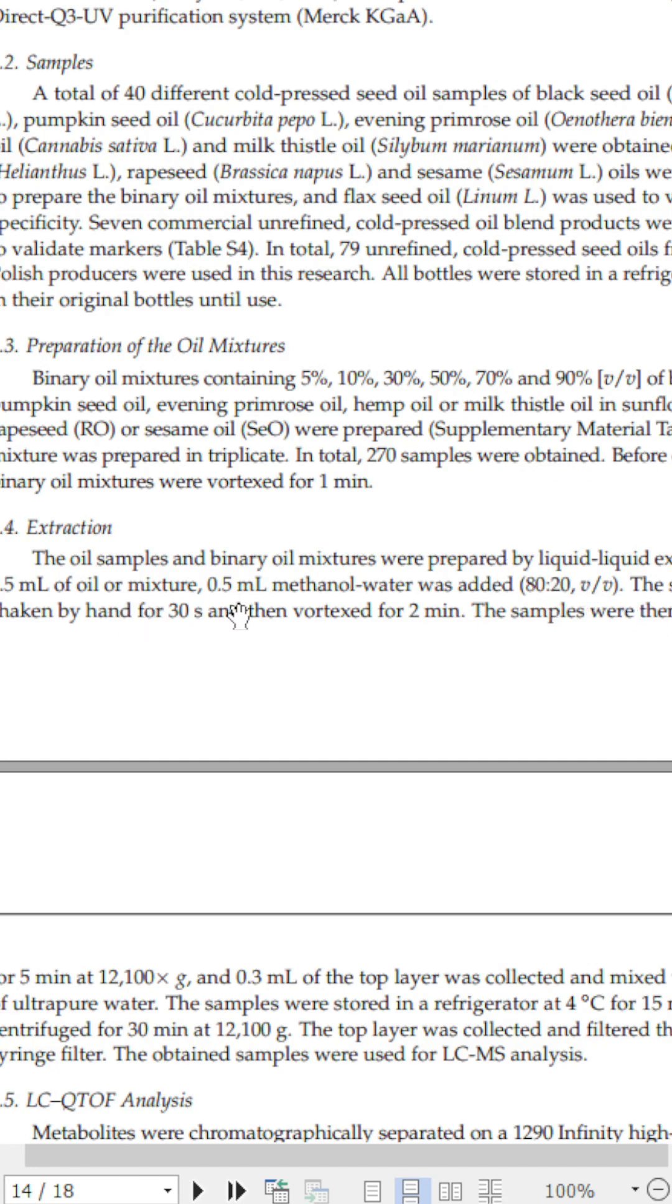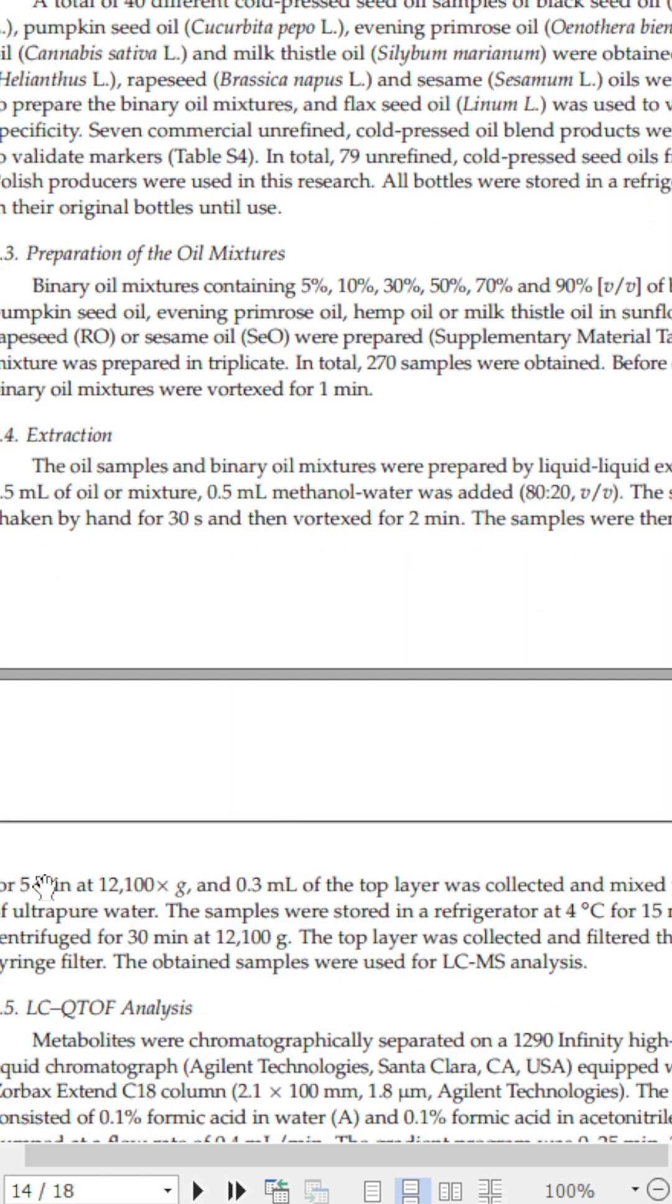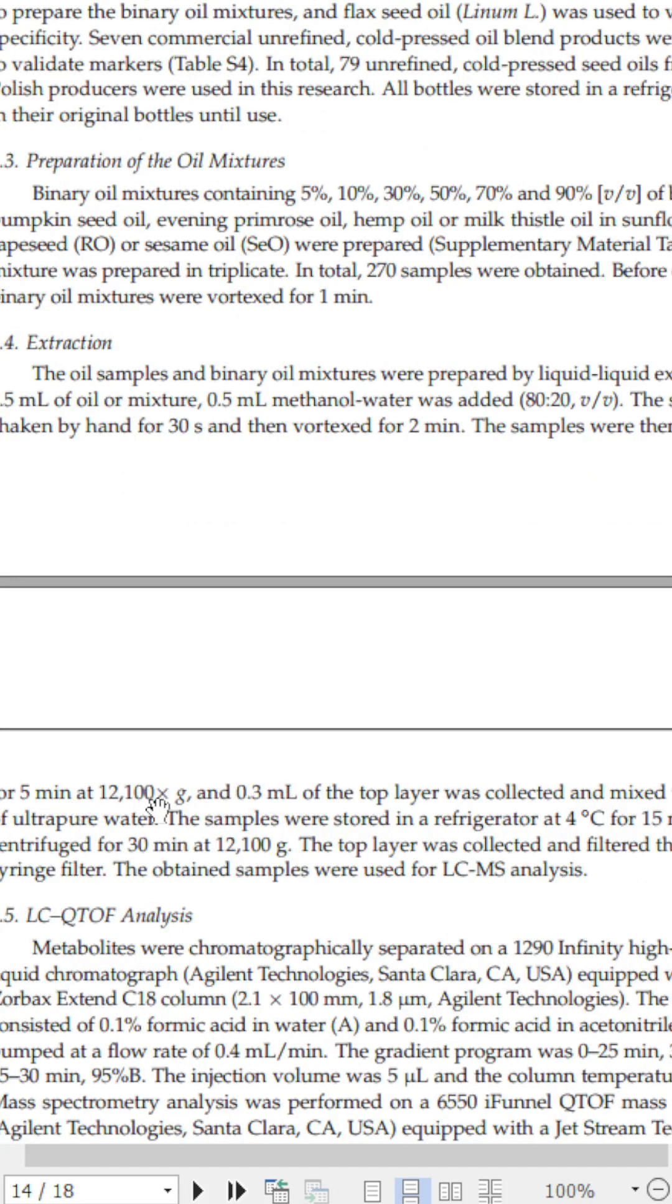So really mixed up good. And then they're centrifuged for five minutes, which I can do here. And then the top layer, 0.3 mL, so like 300 microliters of the top layer is collected and mixed with pure water.